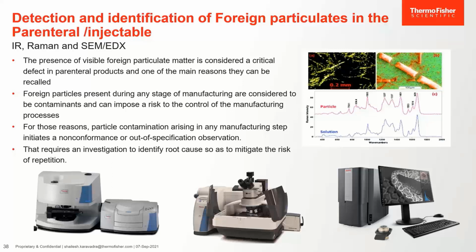For this, several techniques can be used. Infrared microscopy, here iN10, Raman microscopy, DXR-xi or DXR Raman microscope, and a complementary tool, SEM-EDX, can be used too.